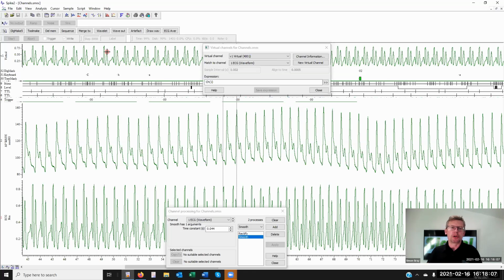They can be used online. For example, if we take something like the DSI telemetry data in, we would have a blood pressure, and we might also be recording what they call an APR, so ambient pressure at the same time. Recorded as two channels, you then want to subtract that ambient pressure from the blood pressure to get a corrected reading out of it. Now, the virtual channel information, that is the expression, sample rate, etc., that goes to produce this, is held within the resource file next to the data file.